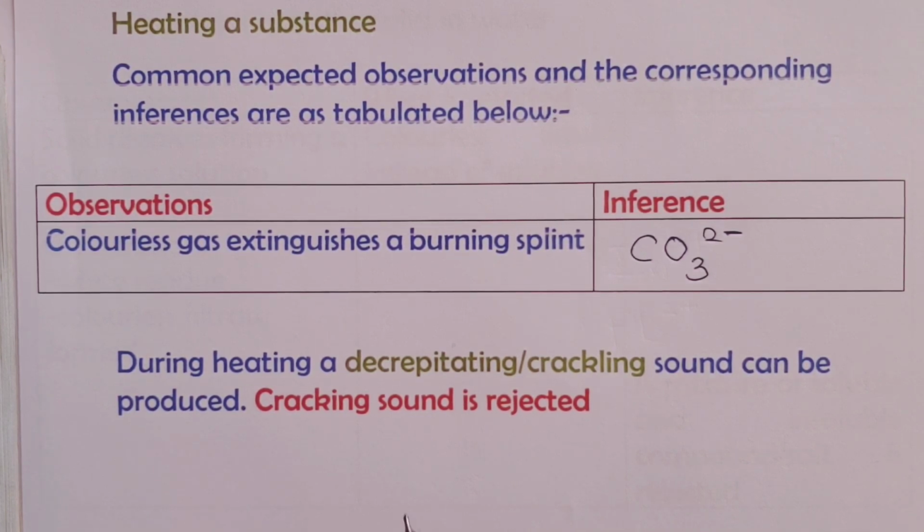So during heating, we expect candidates to talk about decrepitating or crackling sound. But cracking sound has been so common in our candidates. Please get to know that we only allow decrepitating or crackling sound, and cracking sound is normally rejected. Cracking sound would mean that your test tube actually is breaking, and that is normally not the case.